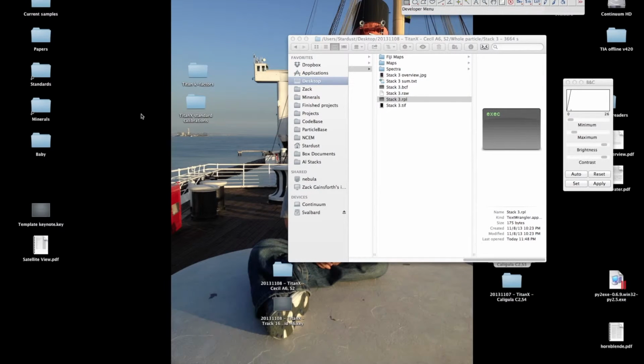Hi. So I'm going to show you how to read in a stack as a raw data format from the Bruker software on the Titan. I'm using a software package called Fiji, Fiji is just ImageJ, F-I-J-I. ImageJ is an open source software for image processing, which handles things quantitatively, so you can do analytical work on microscopy. I think a lot of you are probably familiar with it.